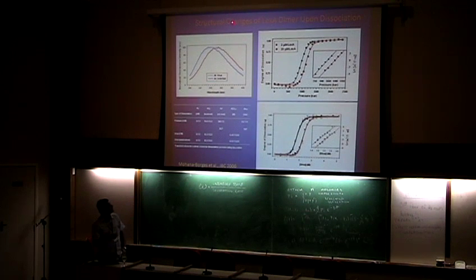When we ran the experiment, if we apply pressure, the protein denatured by pressure, and we were looking at the emission of the tryptophan. But we were surprised when we did a protein concentration dependence. As we increase the protein concentration, we need higher pressure to get the denaturation. That is dependent on the protein concentration, and from this shift in P1/2, by fitting to the thermodynamic equation, we found that it could only be a dimer. We could show that it was in fact a dimer, not only by pressure denaturation but also by urea denaturation.